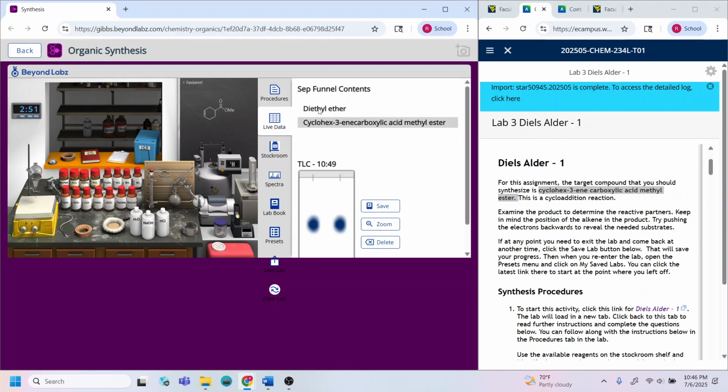We don't have an acid, we don't have a base, so we're not going to use NaOH or HCl. We're going to keep it simple, and we're just going to add water, just creating an organic and aqueous layer in there. And I know that my product is in the organic, so I'm just going to pick the organic. And here you go, this is going to be my product. The ether will directly evaporate, so I will be left only with my product.